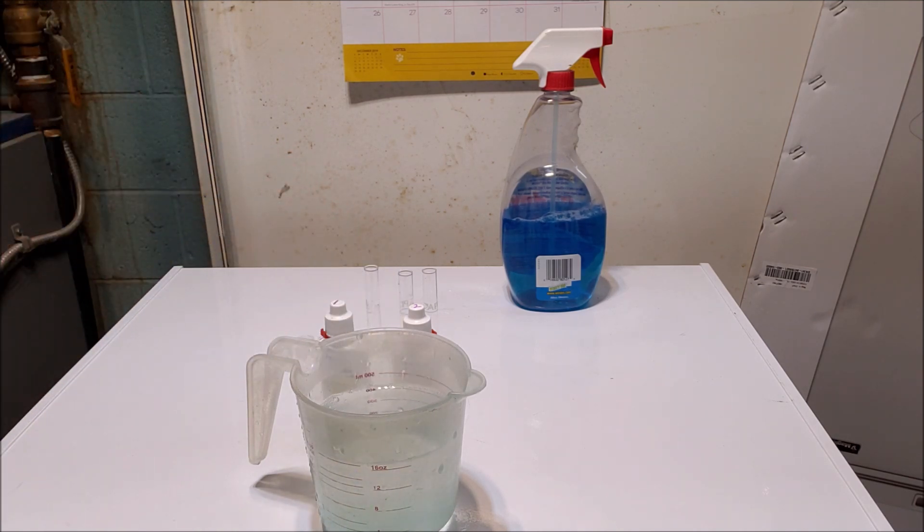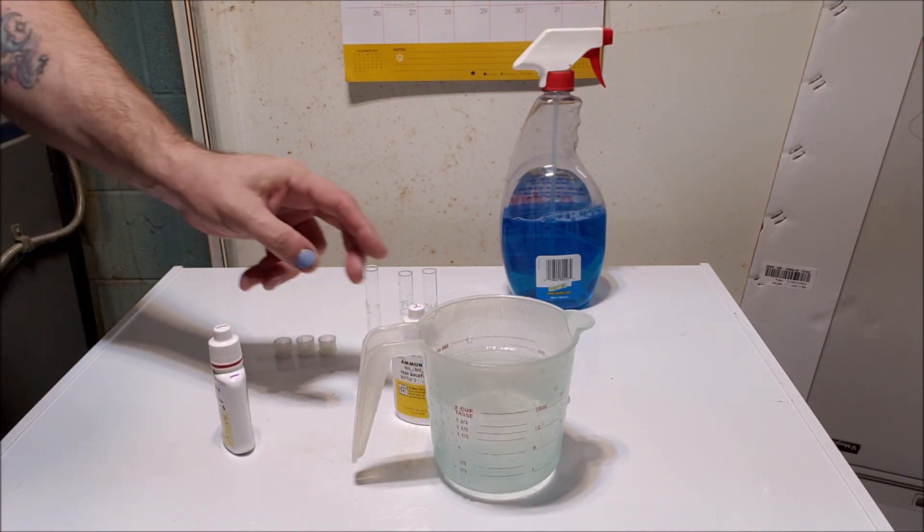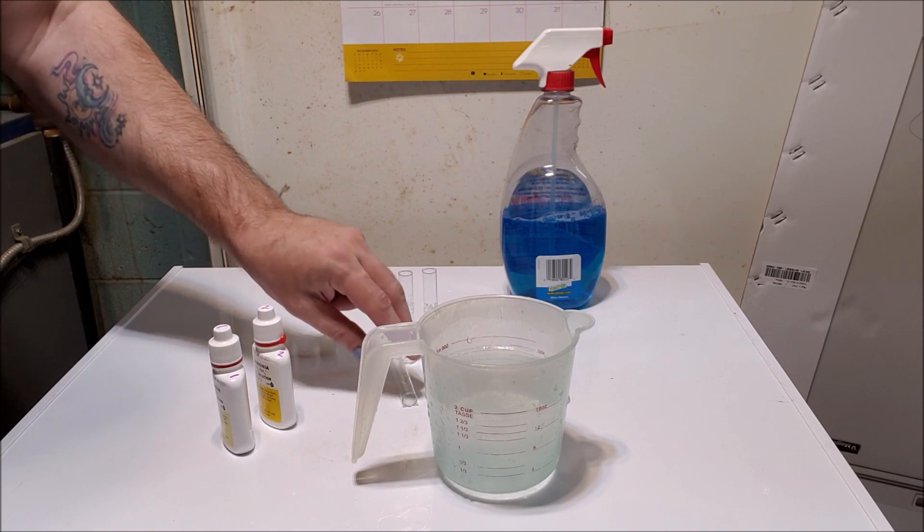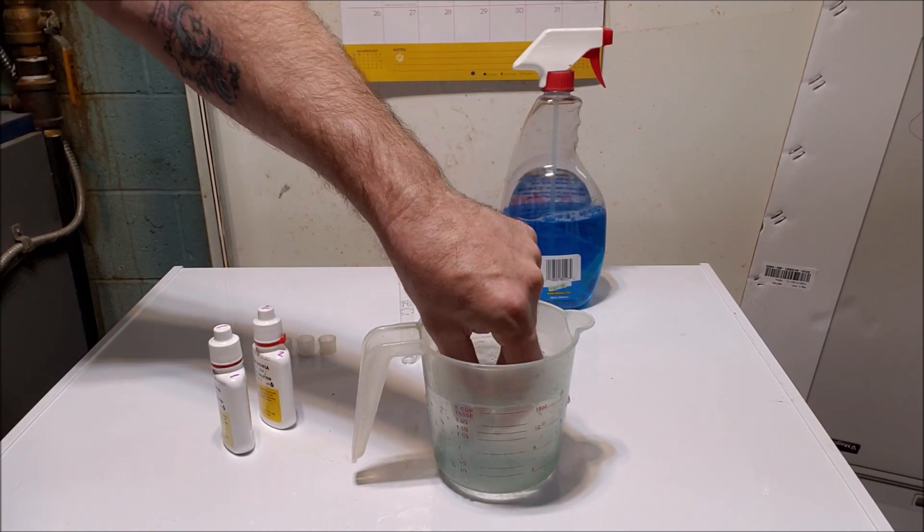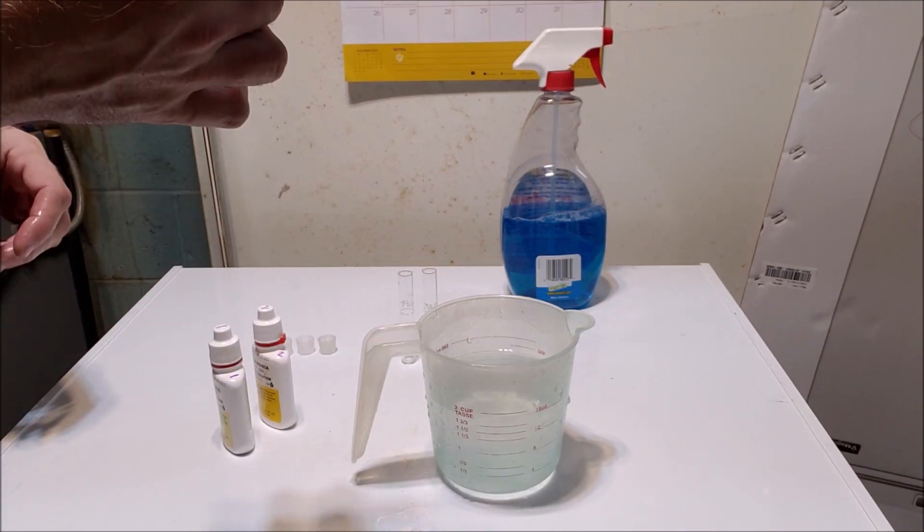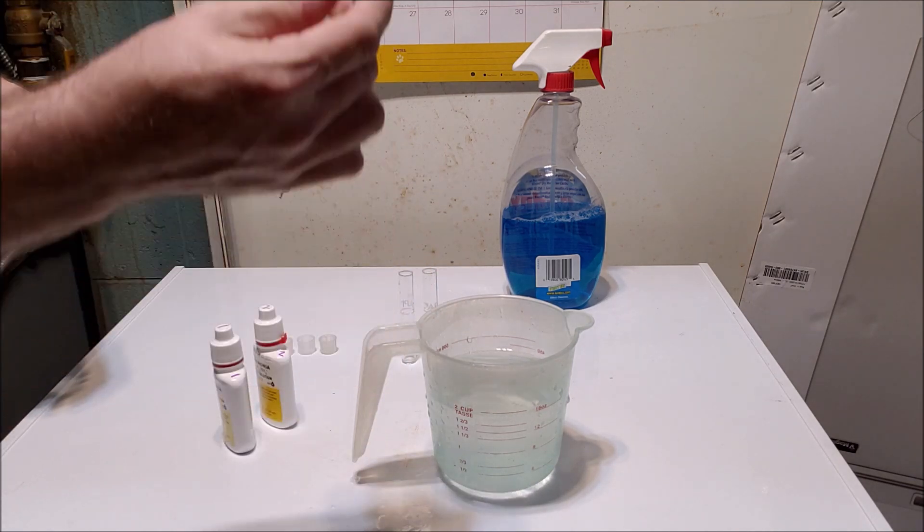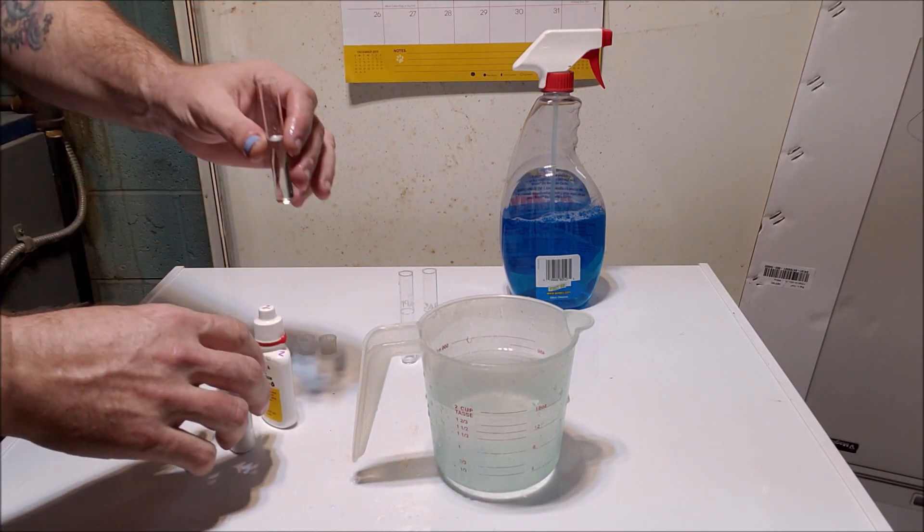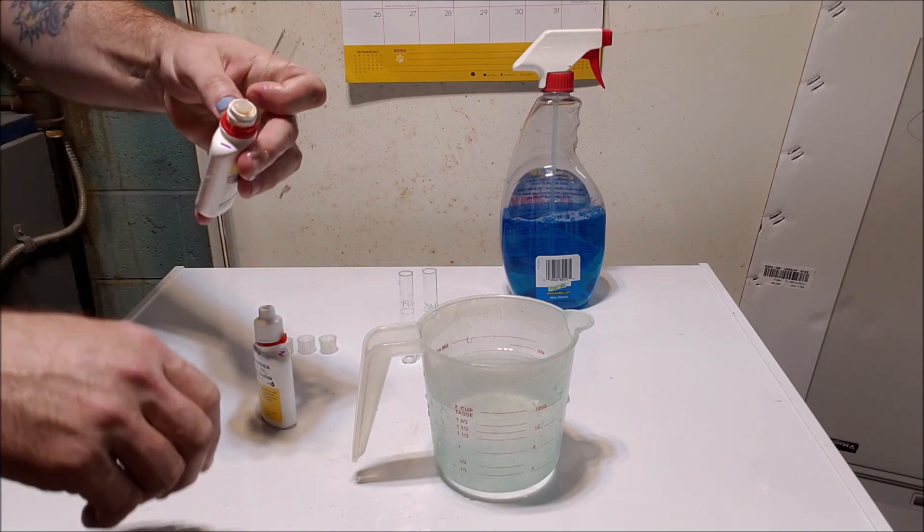What we're going to do is we're going to set the tests up three different ways and we're going to see if the colors come out the same way every time. So first of all, we are going to do exactly the way the instructions say, and that is we're going to put eight drops of bottle number one.